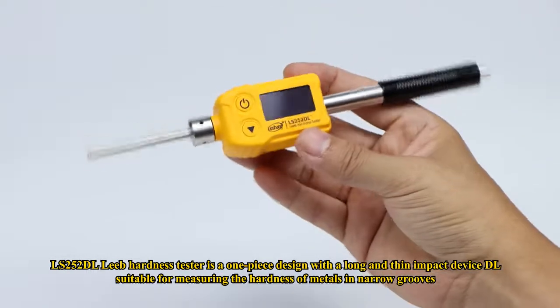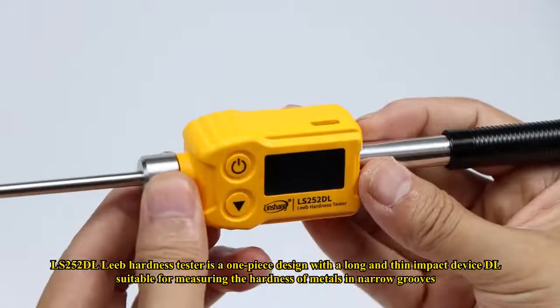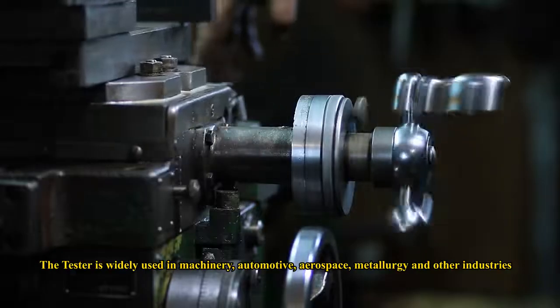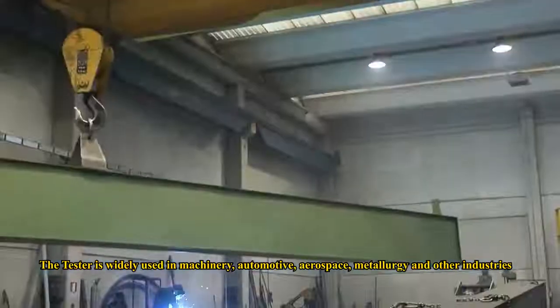The LS252 DL Leeb Hardness Tester is a one-piece design with a long and thin impact device, DL, suitable for measuring the hardness of metals in narrow grooves, on tooth surfaces, or at the bottom of bores. The tester is widely used in machinery, automotive, aerospace, metallurgy, and other industries.